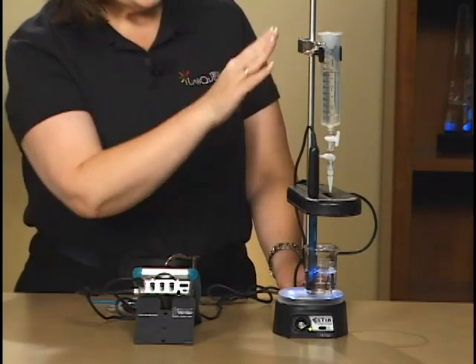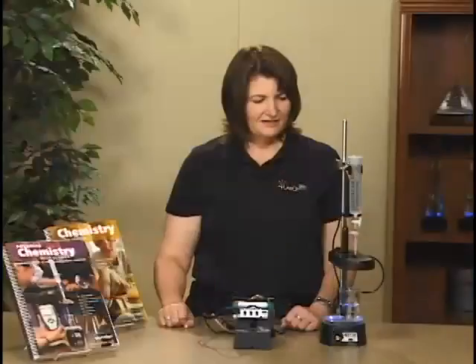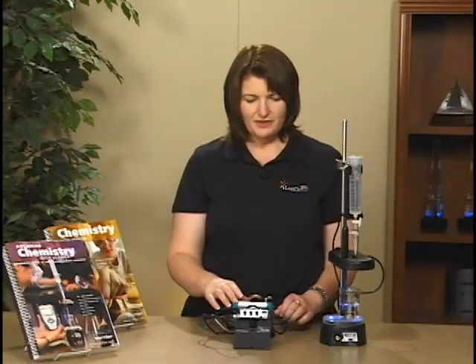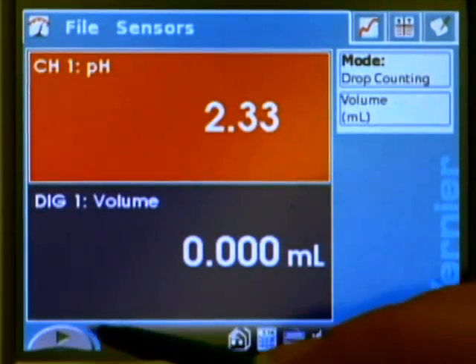The reagent reservoir is just held onto this ring stand which is part of the stir station. The pH sensor and drop counter are both attached to the LabQuest interface and they have auto ID'd and so we're ready to go.